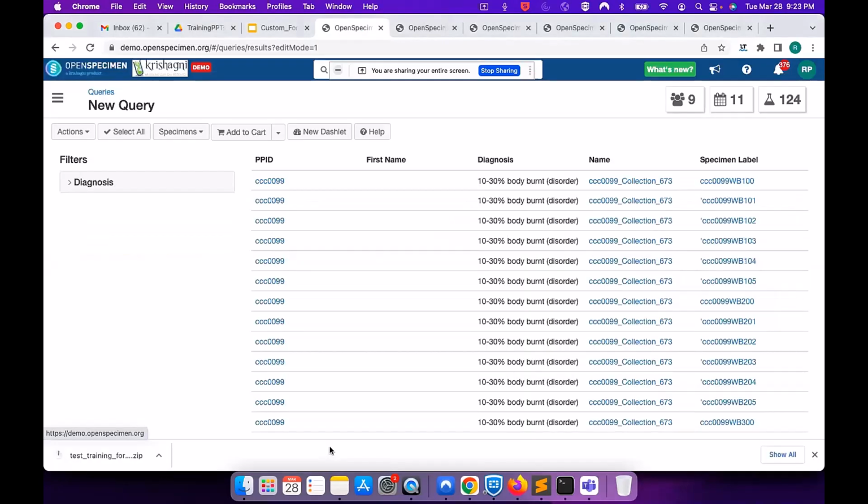So the thing is, you need to add multiple such filters. So as many filters as you want, you can add while you build the query. What you need to know is what is the right field where you are documenting this information within your collection protocol. If you know this, then you can keep on adding multiple filters.